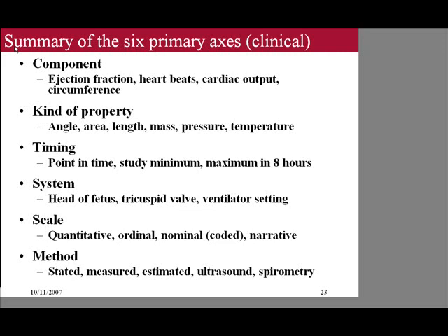And scale really gets close to saying what's the data type for this element. Is it a numeric data type? Is it an ordinal data type? If it's a 1+, 2+, 3+, or the answer is mild, moderate, severe, I can put them in order, but it's not a scalar representation of that item.